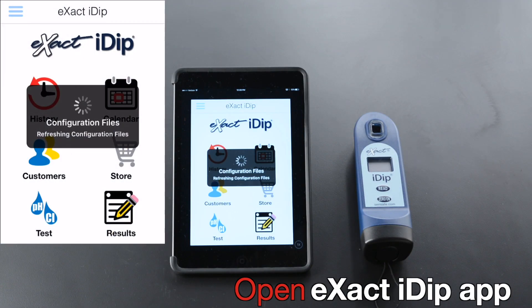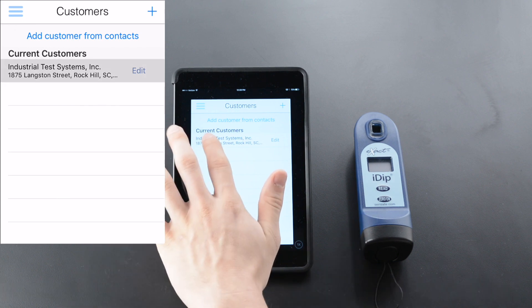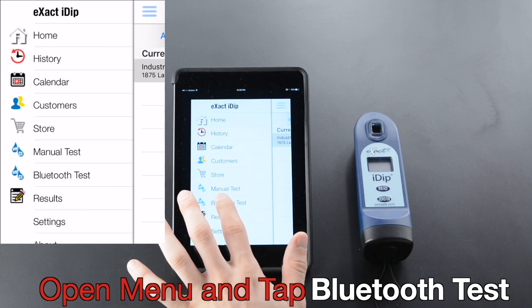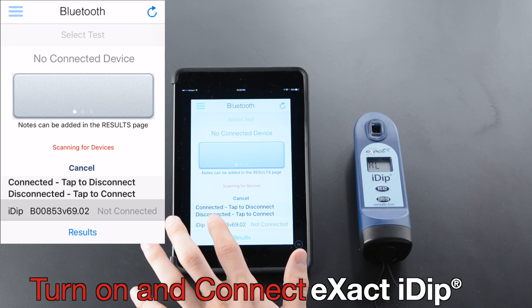Open the XactiDip app. Tap Customers, select customer, open menu, and tap Bluetooth Test. Turn on and connect XactiDip.